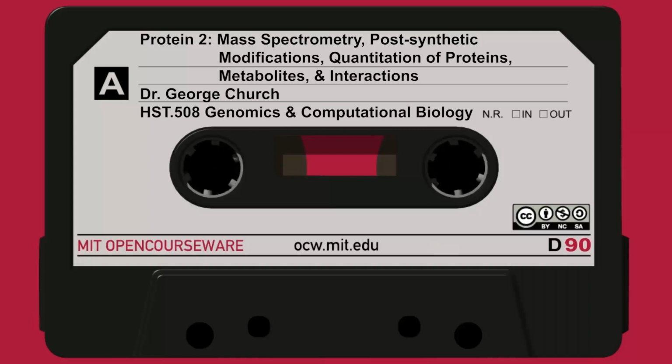Now you cleave it into peptides, and you analyze the peptides by retention time and, the three dimensions, strong cation exchange, retention time, and mass. And then you add a fourth one, which we'll develop a little later, where you can actually break up the peptides into little pieces, so you can identify which protein each of the peptides came from.